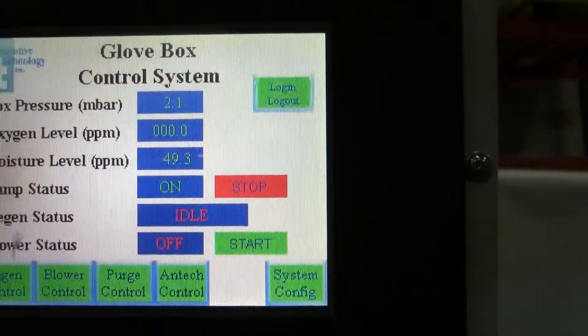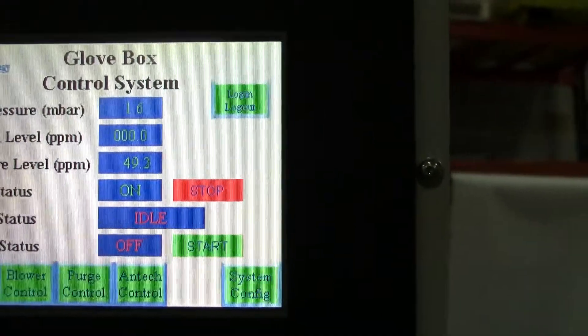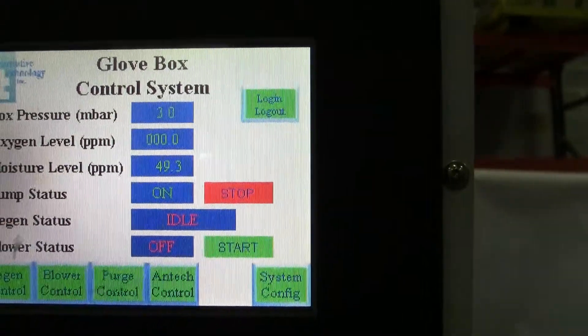See the oxygen level has dropped, and the moisture level is going to keep going down. We just turned the instrument on about 20 minutes ago, so it's going to keep dropping down.